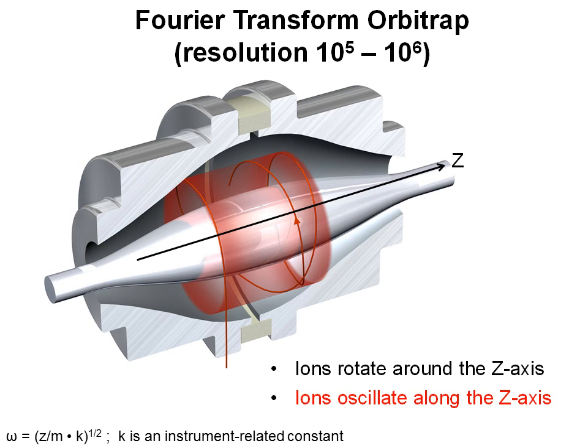It's thus a very high resolution mass analyzer that can be used in regular bioanalytical laboratories. It's still mostly in research instruments, but it's finding its way more and more also in routine laboratories, for example here at the University Hospital Pharmacy.